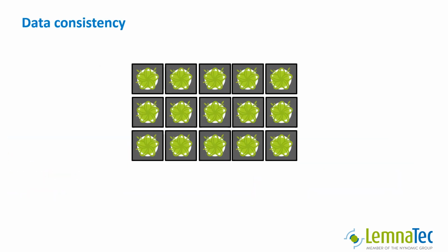This design has one important consequence. Once a snapshot has been annotated, its sample layout is fixed. If you later try to start an analysis for a different layout, the system won't let you do this. Assume you have an image of a plant tray with 3x5 plants, and you have analyzed them accordingly.